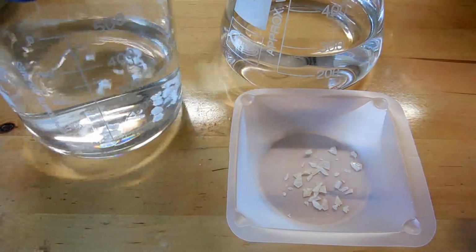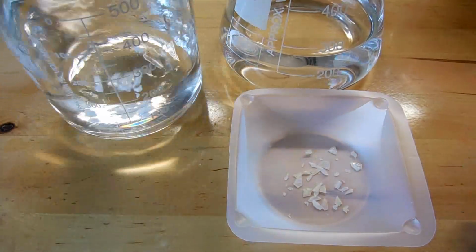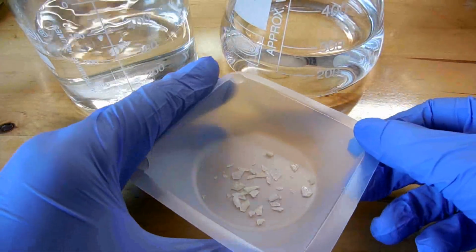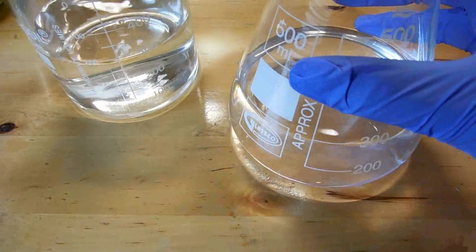Potassium iodide should dissolve extremely quickly, it's very, very soluble. The lead nitrate might be slightly more problematic, but we'll see what it does.